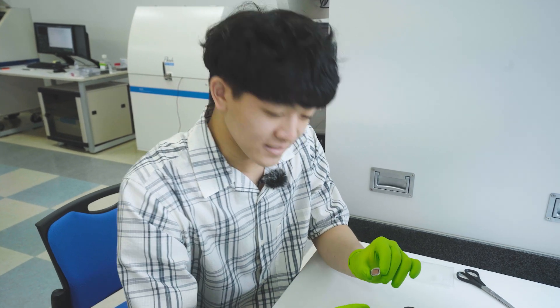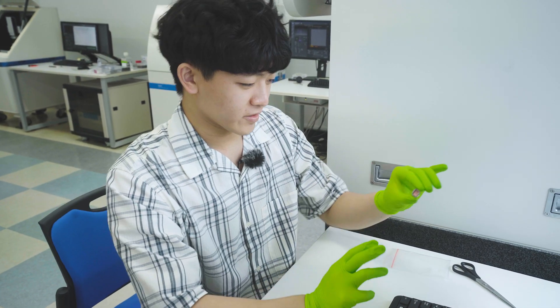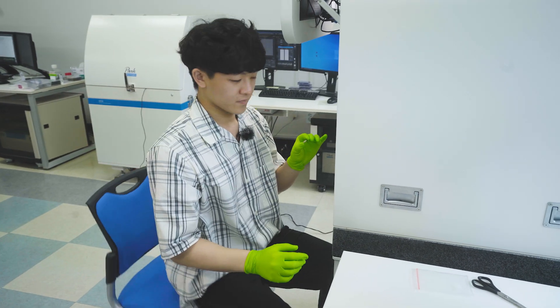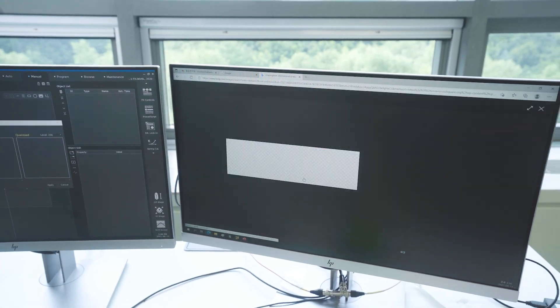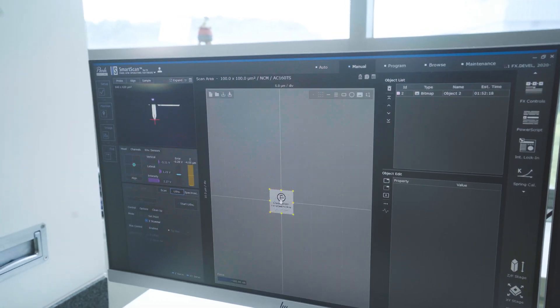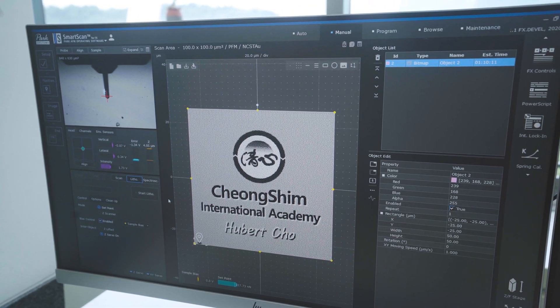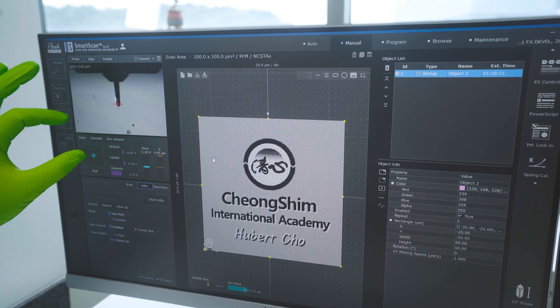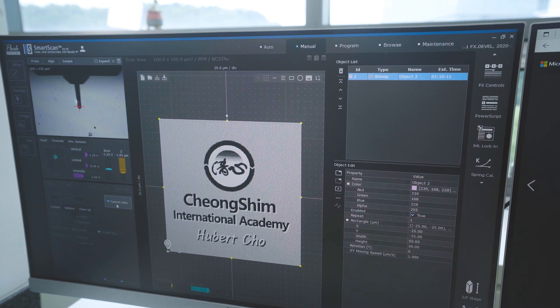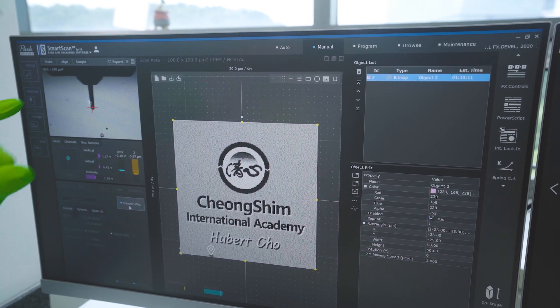Finally, I'm going to be trying my hand at nanolithography, which is basically just lithography writing but on a nano scale. I'll be writing on this sample here. We finished setting up now, and we can see this is where we're going to be writing the design. We press the button and start — the tip is now slowly moving and engraving the design into the sample.